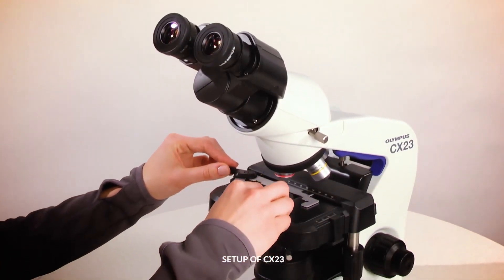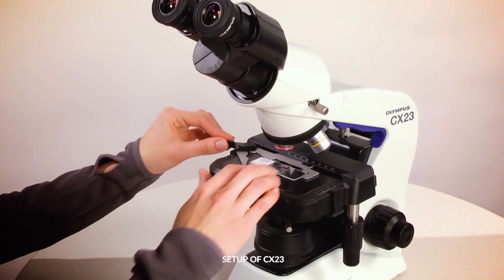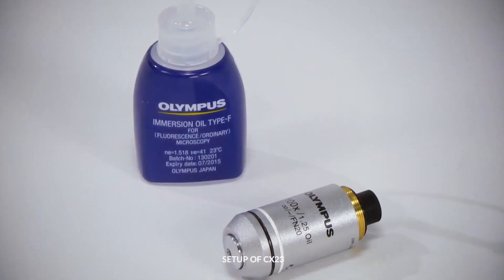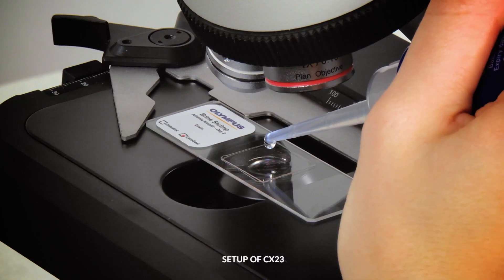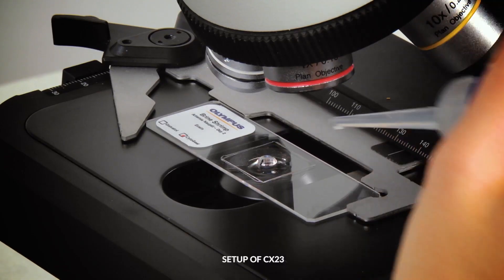Your CX-23 microscope is now properly set up and ready for slide viewing. If using a 100X oil objective, make sure that you add a small drop of oil to the slide prior to use.